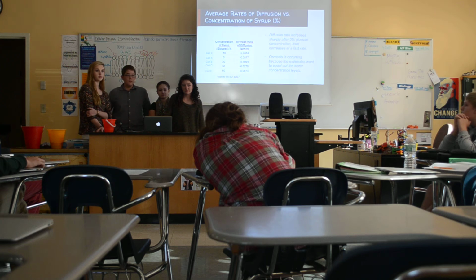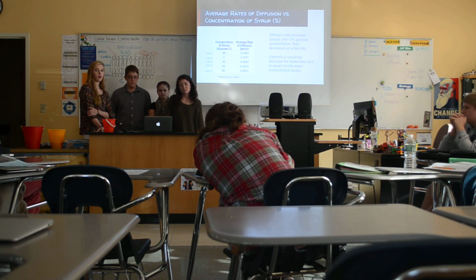Ella? Is this the same stuff that they use when they go through blood and such? Dialysis tubing. There are medical uses for various sizes and materials like that. Yes.